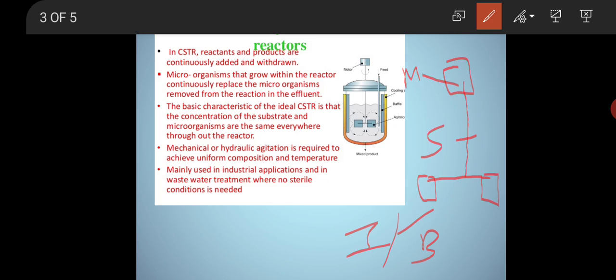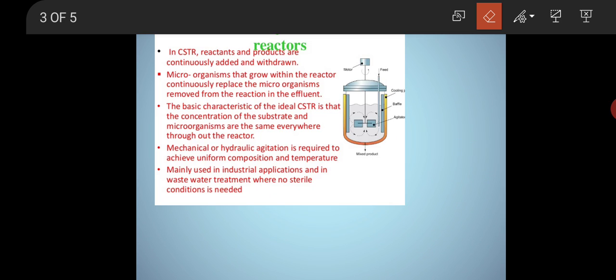See, if you can see the diagram of the fermenter, the center line that is shown is known as the shaft. The motor is connected at the top and below are the blades, which are known as the impeller. So this is the typical design of the agitator. Let me erase it.